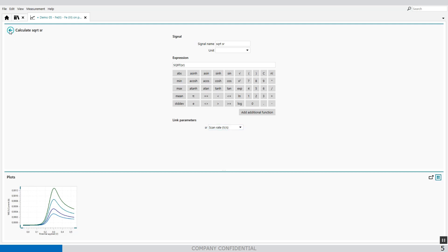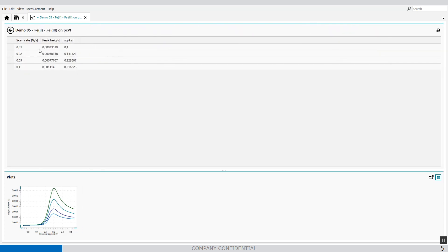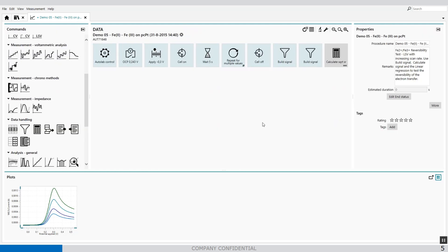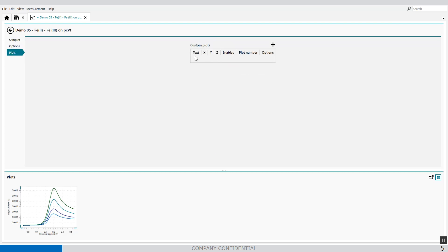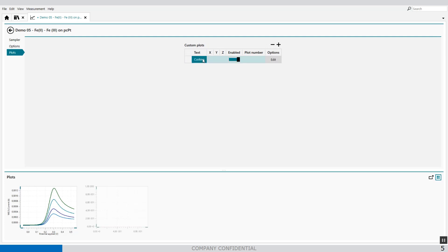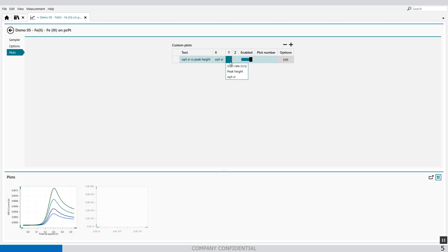After we've done this, we can go back, and now we've extracted all the information which is needed: peak height and square root over the scan rate. Now we can plot these variables by pressing more. When we press more, we can say plot, we can make a custom plot and add a new plot — square root of the scan rate versus peak height. In the x-axis I can say square root of the scan rate, and in the y-axis I can say peak height.